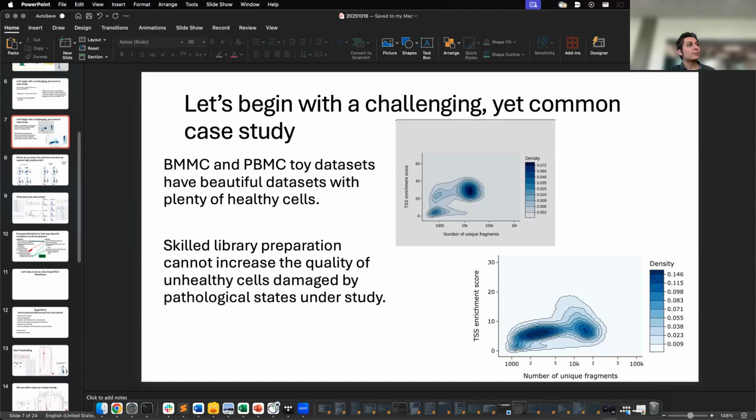I mean, could you automate that selection, just pick the steepest part of the curve on the distribution? Working on it, yeah.